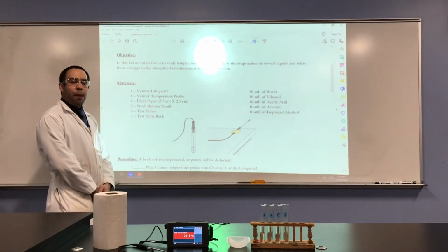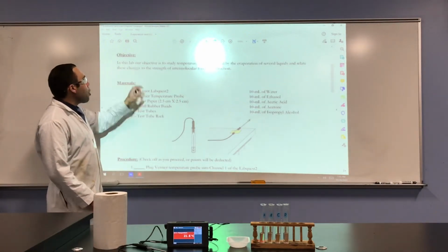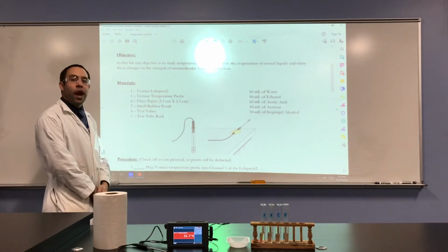And welcome to the Evaporation and Intermolecular Forces lab procedure. Our objective for today, in this lab, is to study temperature changes caused by the evaporation of several liquids and relate these changes to the strength of intermolecular forces of attraction.